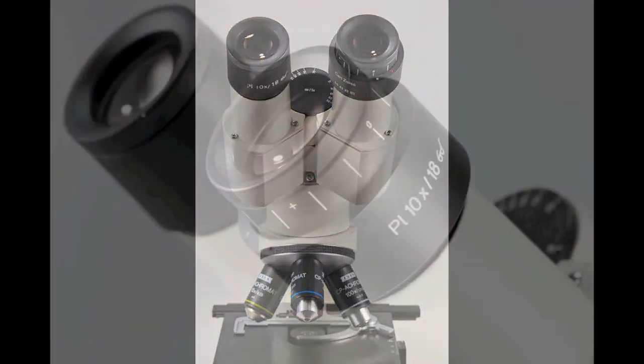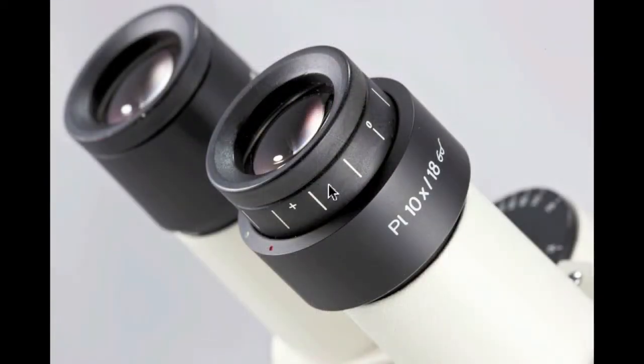rotate the diopter ring on the right eyepiece until the focus is correct in both eyes. This procedure will provide a clearer view of the objects with less strain on your eyes.